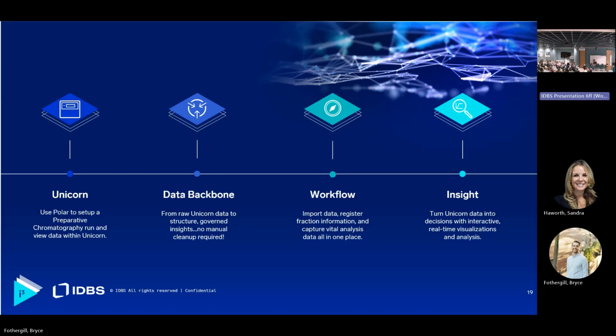So one question. Do you have on your roadmap integration with a solution like TetraScience? Because this is also the goal, to ingest a lot of different kinds of data. And if there is a connection with TetraScience, we can have it directly with one connection.